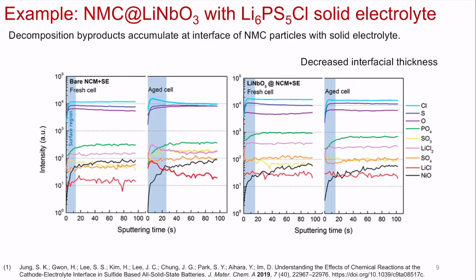Okay. Quick question, just to make sure I got that right. From the edge sample, the blue region, the bare and coated, it takes you not a long time to observe nickel oxide from the bare sample relative to the coated. Yes.